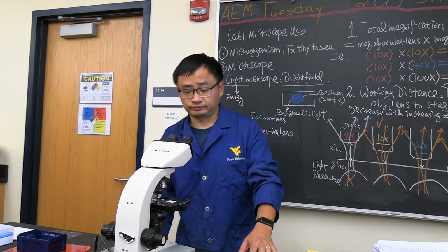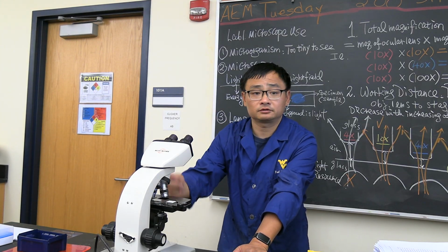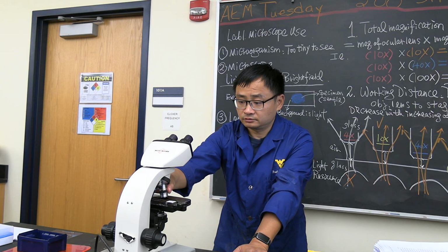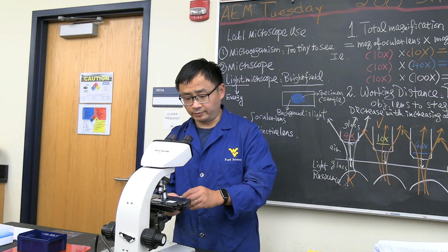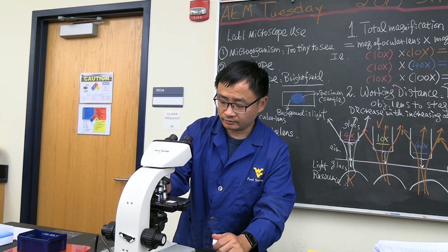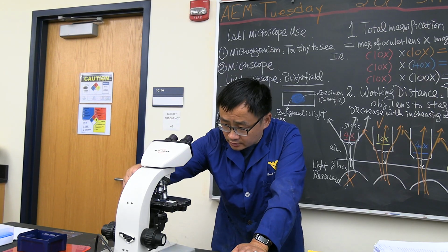How do we do it? Remember, never use 40x for this. Lots of people directly do this. No, that's 40x. Only once. So, one twist, second twist, like this, then put one drop of the oil. A big drop. This has to be big, at least cover the circle. So you go here.